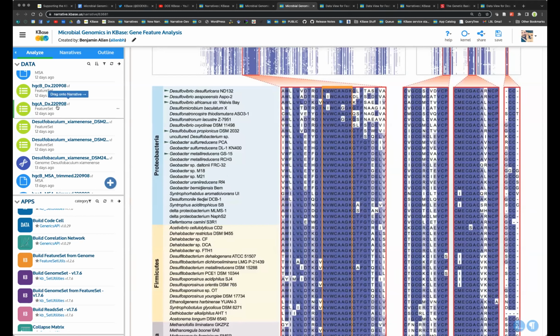This is the exciting thing about KBase: we've built a data object that represents this key finding from this paper, that I can then use to search against whatever organism or metagenome I get, and that will help me understand if there's any mercury methylating potential within those organisms.